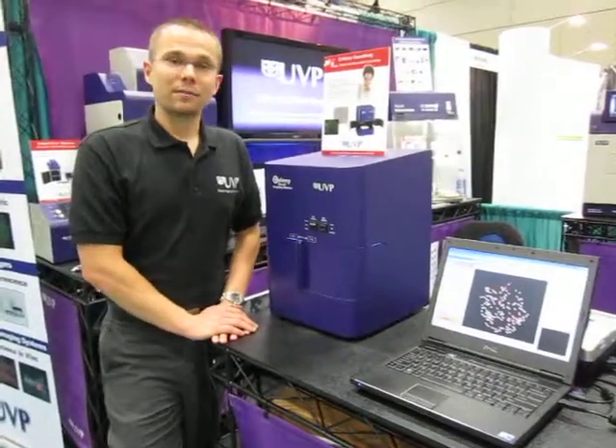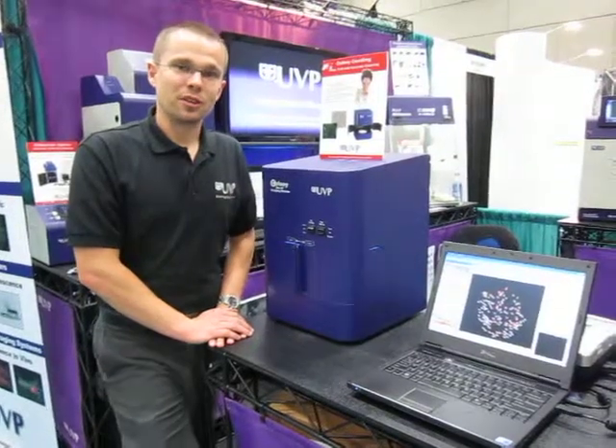Please feel free to take a look at the Colony Docket Imaging Station to meet your colony counting needs. Thank you.